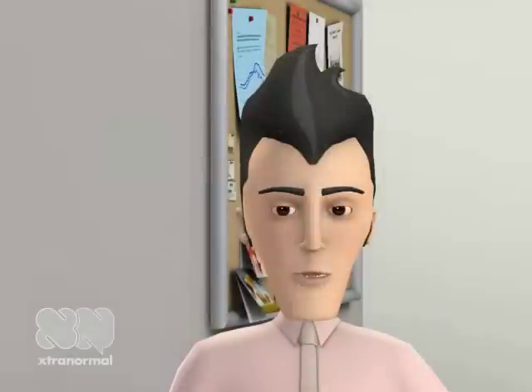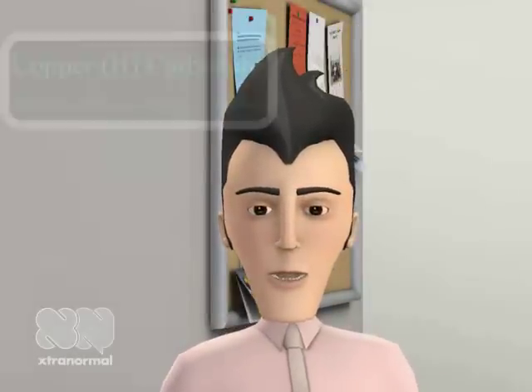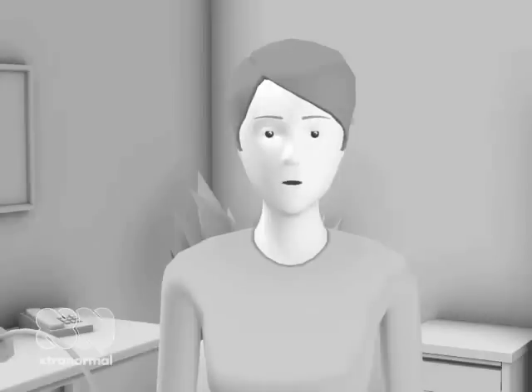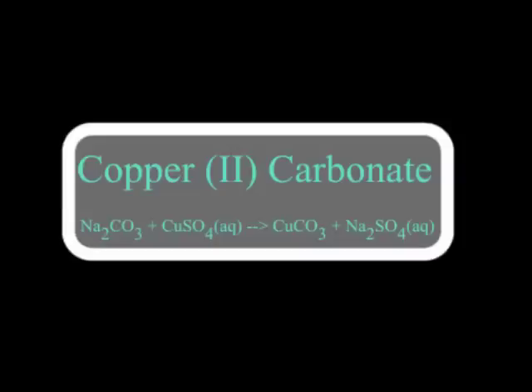To begin the synthesis, we are going to create copper carbonate by reacting copper sulfate and sodium carbonate. To do this, I'm going to hand you over to my capable assistant. Today, I will be showing you the synthesis of copper carbonate from copper sulfate in this segment.